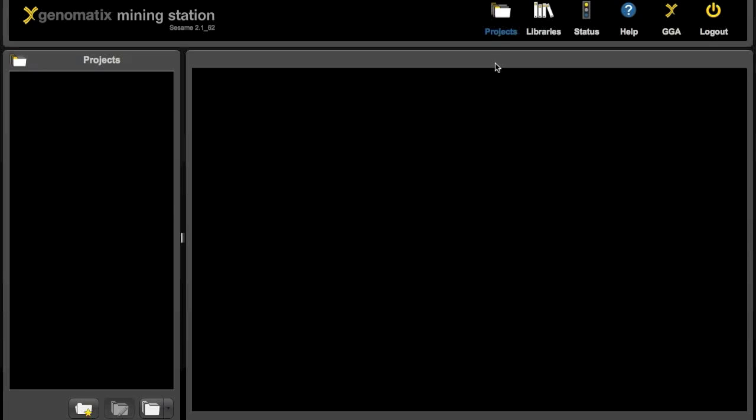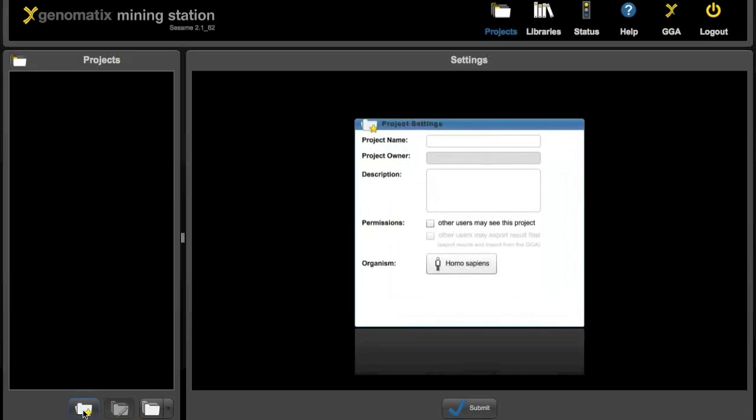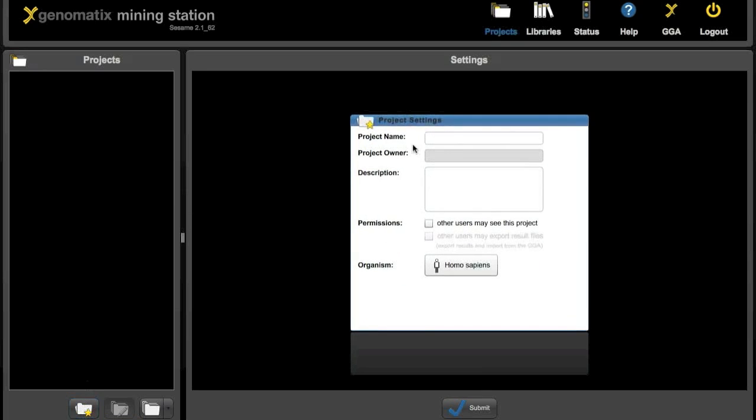As you can see this is empty for now. So first we need to create a new project which is done down here. And now we can give the project a name.